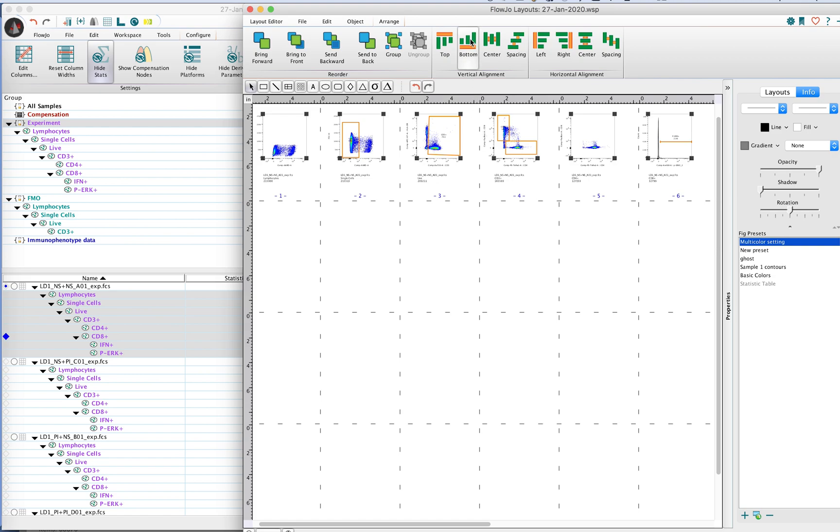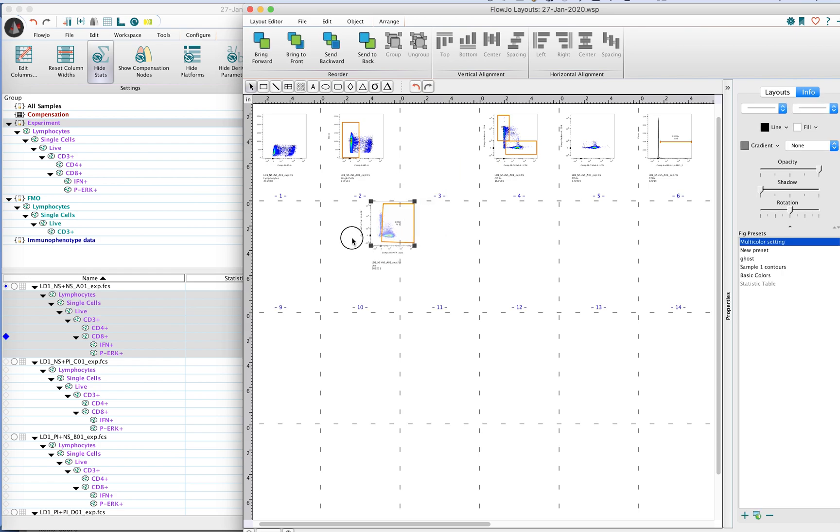You also have other tools here to align them towards the bottom or towards the right, so that you can set up a series of plots in a lot of different ways.